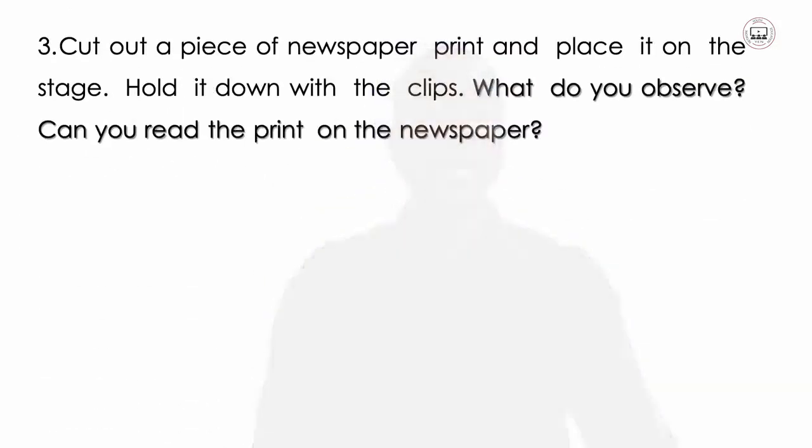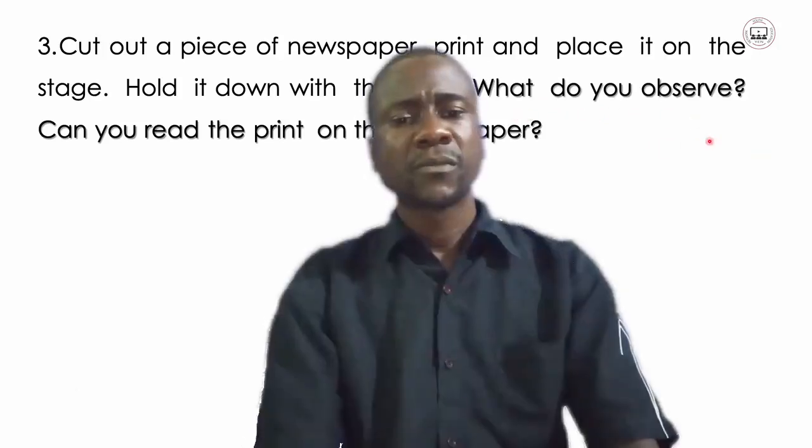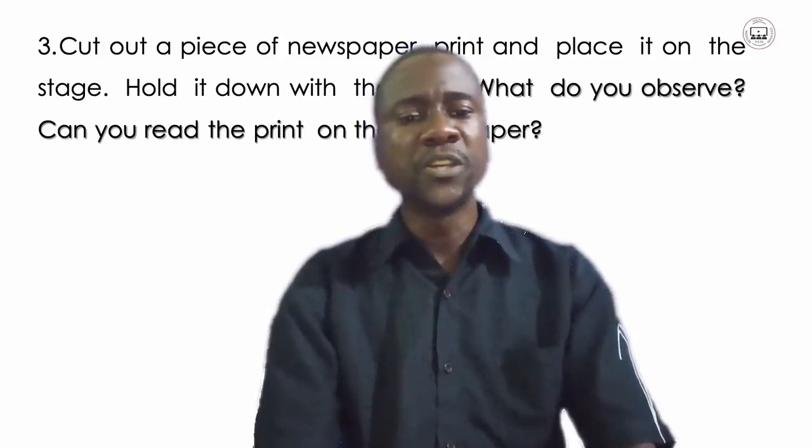And from then, cut out a piece of newspaper print and place it on the stage. Hold it down with the clips. So what do you see, or what do you observe? You can read the print on the newspaper.